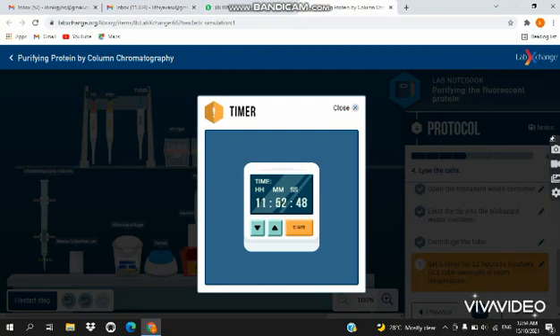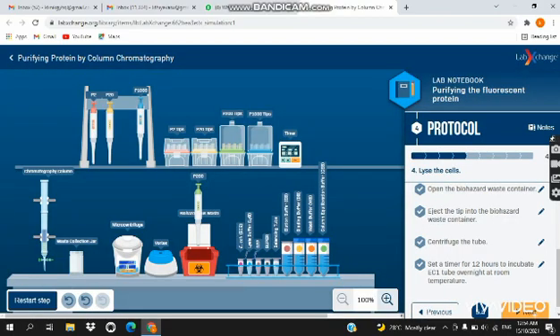Okay, start. 12 hours. Then the lysis process is done.